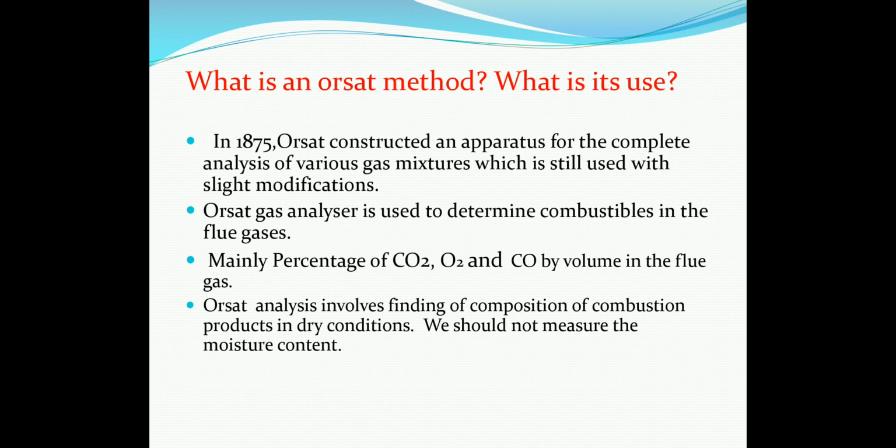Let us see what the Orsat method is and what its use in flue gas analysis is. In 1875, Orsat constructed an apparatus for the complete analysis of various gas mixtures, which is still used with slight modifications. Orsat gas analyzer is used to determine combustibles in the flue gases.